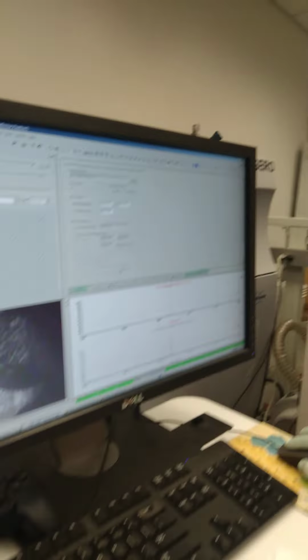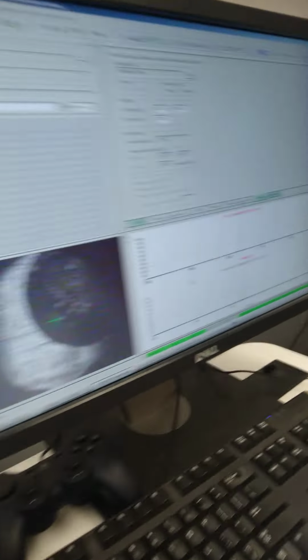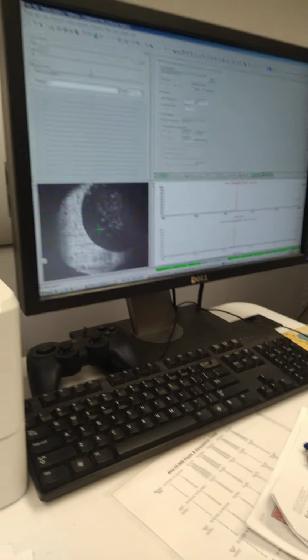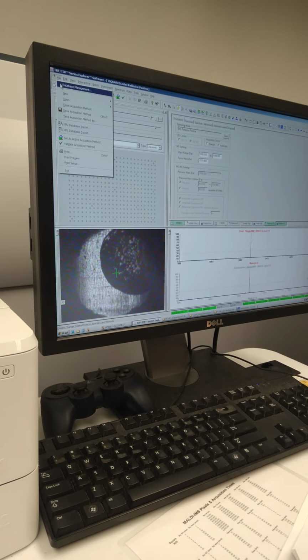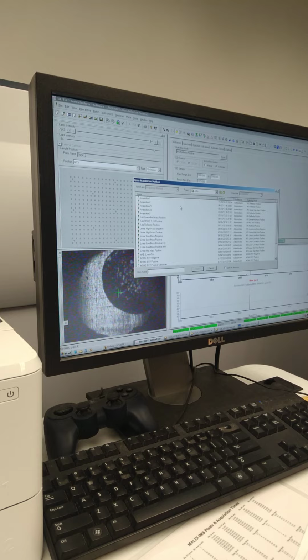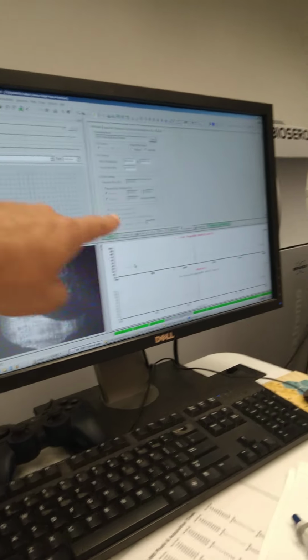Okay, so right now we're in reflector positive, the acquisition method, reflector default, processing, and that's the best mode for peptides, but you want to go ahead and do proteins. So let's go ahead and open up the linear high. So you go to File, Open, Acquisition method, and then you would go to the linear high mass positive method right there, and hit Open. And it's already open, so it's just highlighted there.